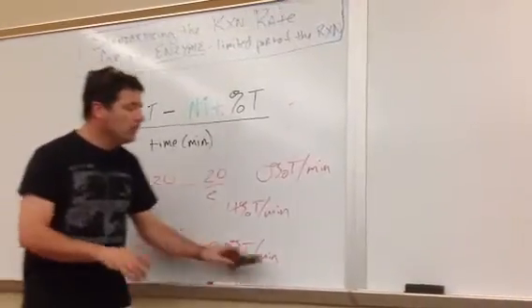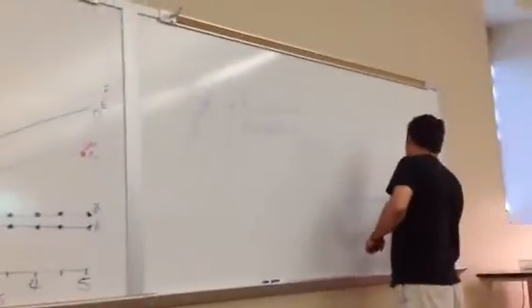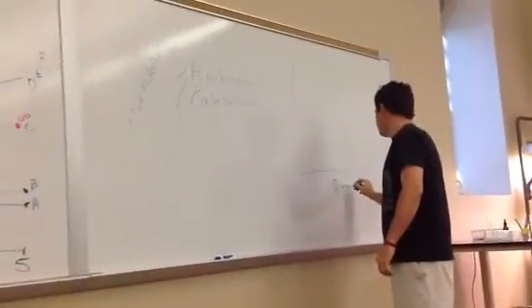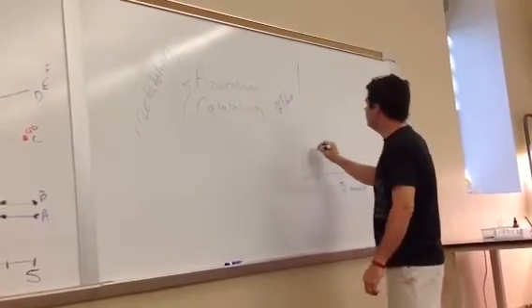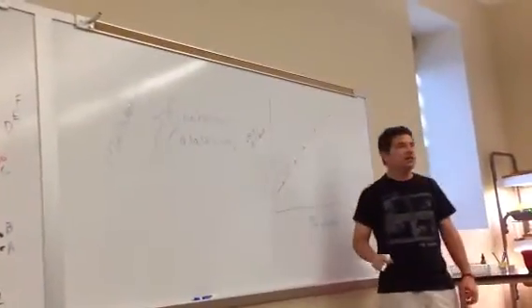Right? So hopefully what you ended up with is, on the next page, you have a graph here, and what are the axes? It's percent amylase, and it's percent T per minute, right? And so you should have ended up with something like this. Now your dots probably aren't on exactly that line, right?